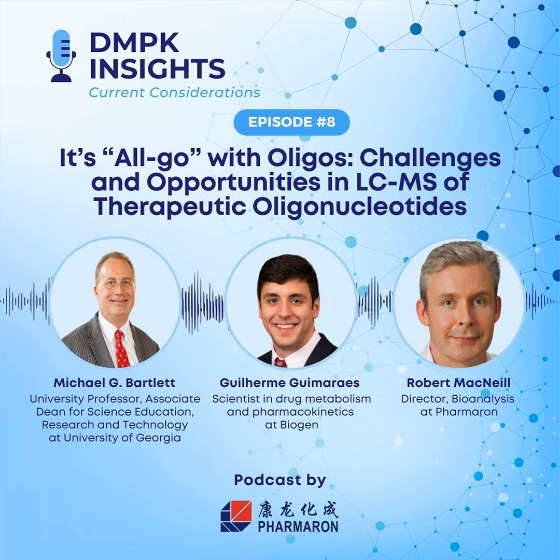Right, and HFIP is expensive enough. That is correct, and you need very high grades. It adds up, and the fact that you need to make mobile phases and you need to make them more often, the bills start to stack up for sure. Yes, and with all the concerns that are primarily focused in Europe just now, like you alluded to, I think the whole dynamic is slowly changing. So even more focus on the likes of HILIC as a viable option.